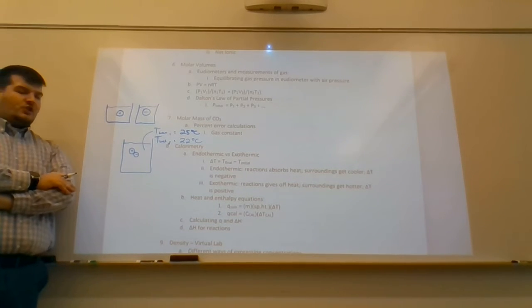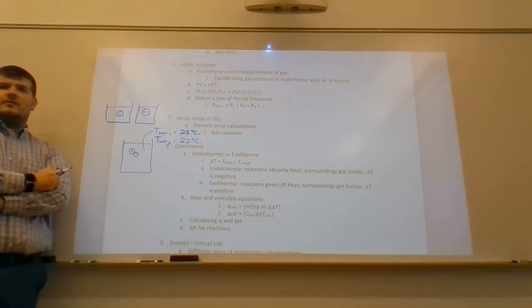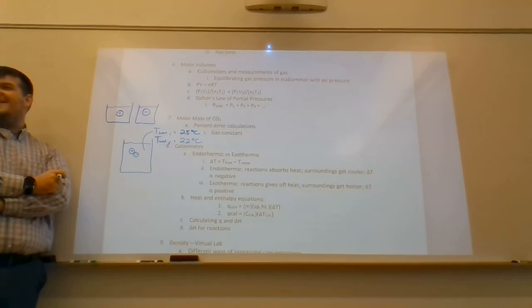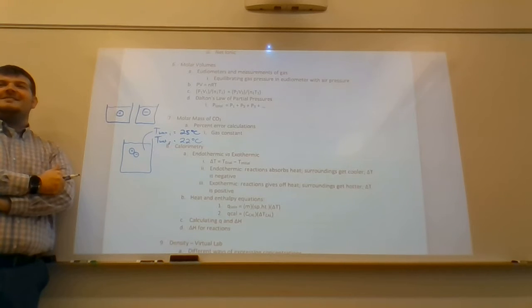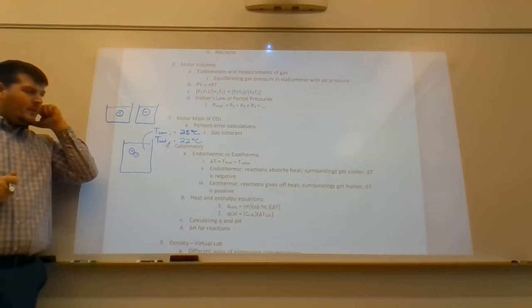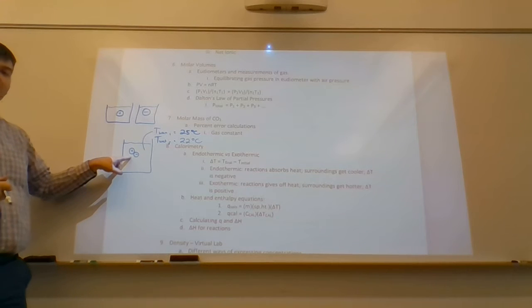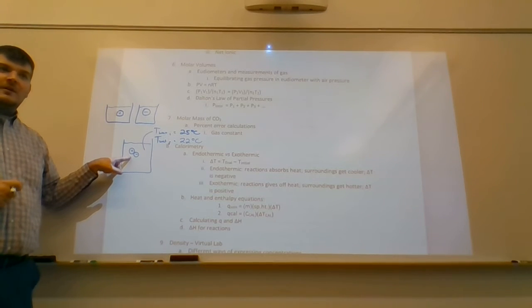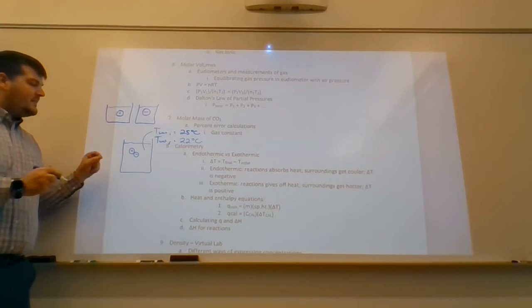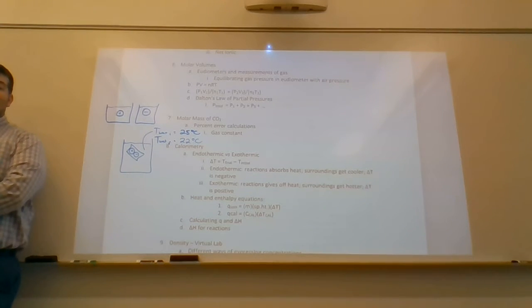Is this reaction, mixing the cation and the anion, endothermic or exothermic? The answer is that this reaction is endothermic. The reason is that the heat is coming from the water and going into this system in order to make that ionic compound. So it's an endothermic reaction because the system itself, which remember are these ions, is what's gaining that heat.